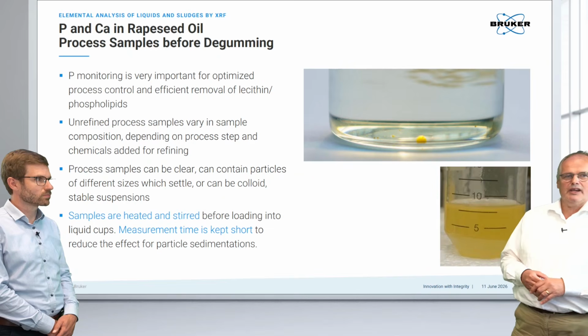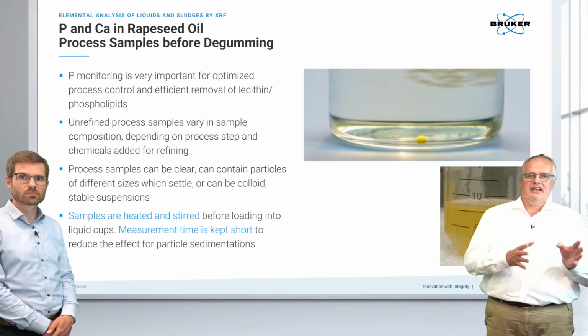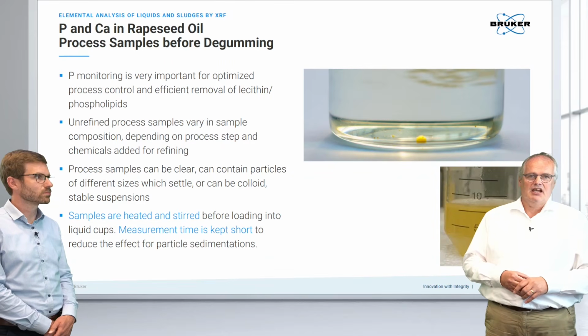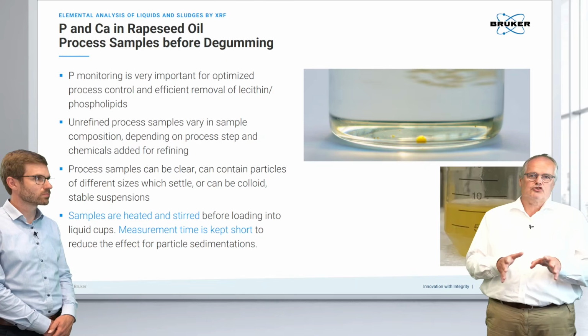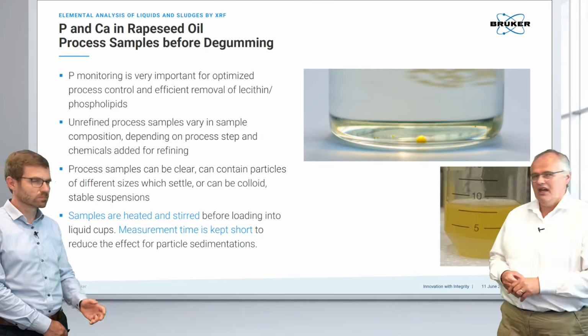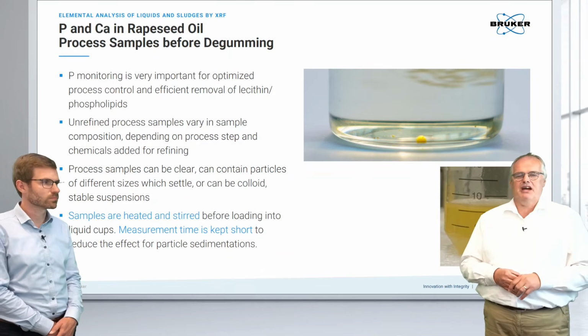There's one simple way: you heat up the sample and you stir it, and then you take the warm sample directly and analyze it. And by doing this, you ensure that you always have the same sample conditions and avoid the separation of phases or particles, right?